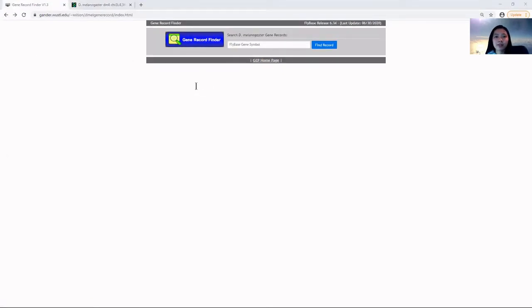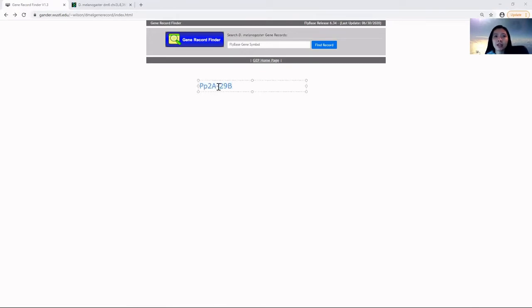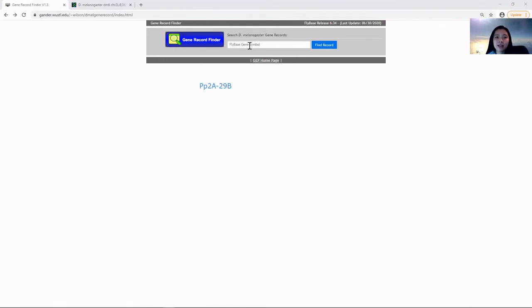For this demonstration, I'll be using the putative ortholog PP2A-29B as an example. You will enter your putative ortholog or gene in the search box.